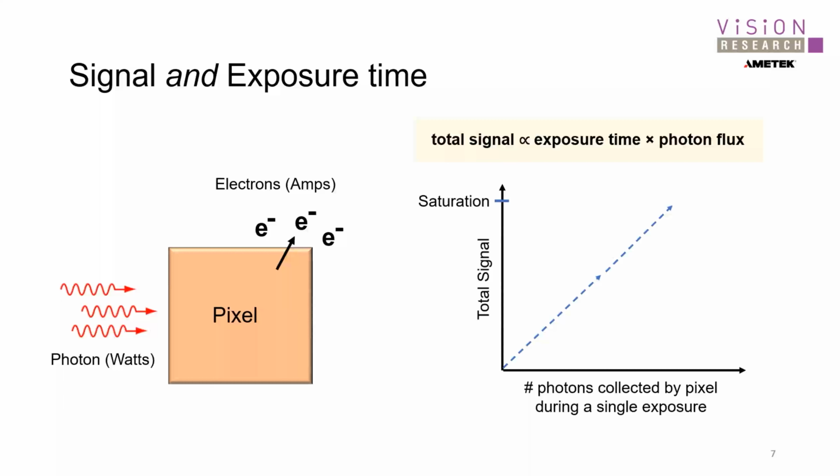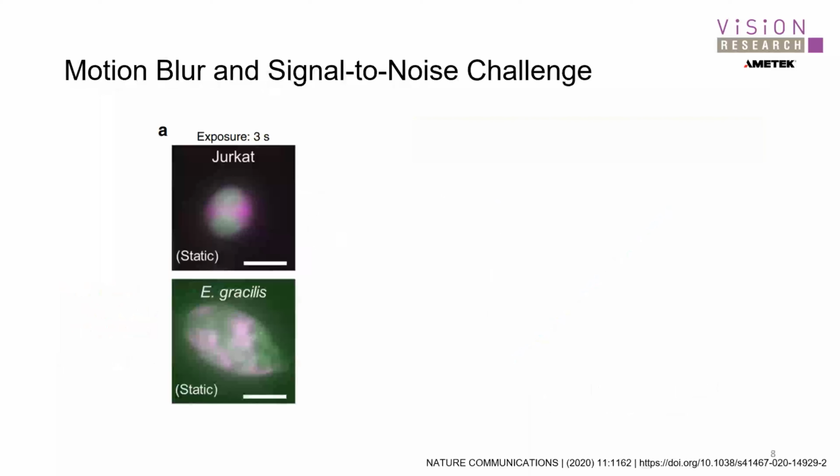So this puts us in dire straits because, as we saw, very high frame rates lead to very short exposure times, and fluorescent events have very low amount of light coming out of them. All right, so let's look at what the data shows us, right?